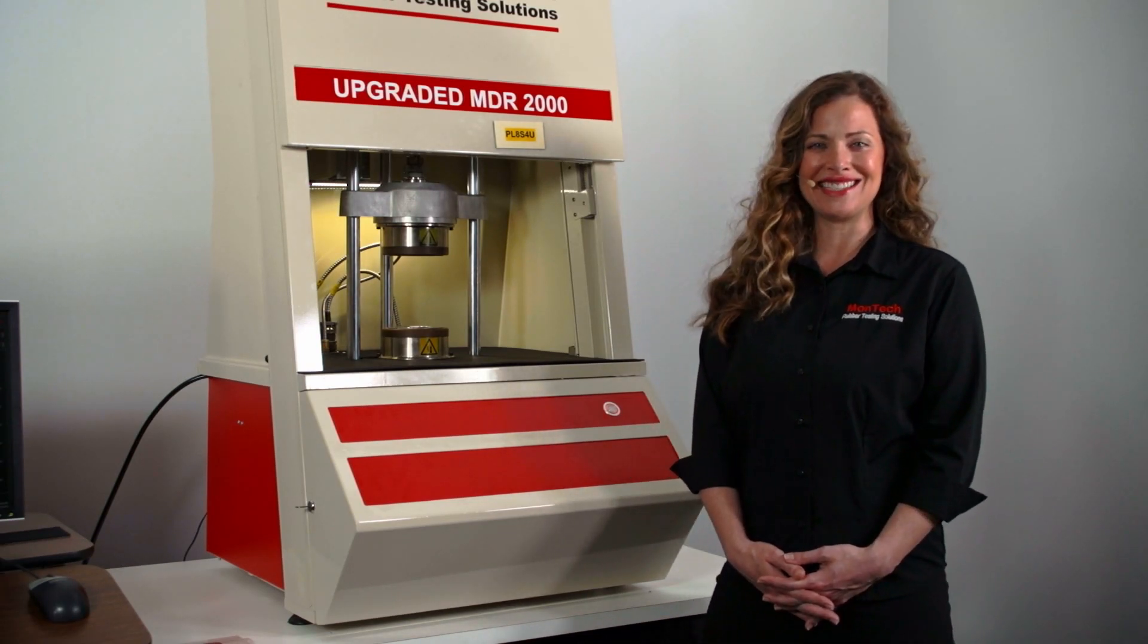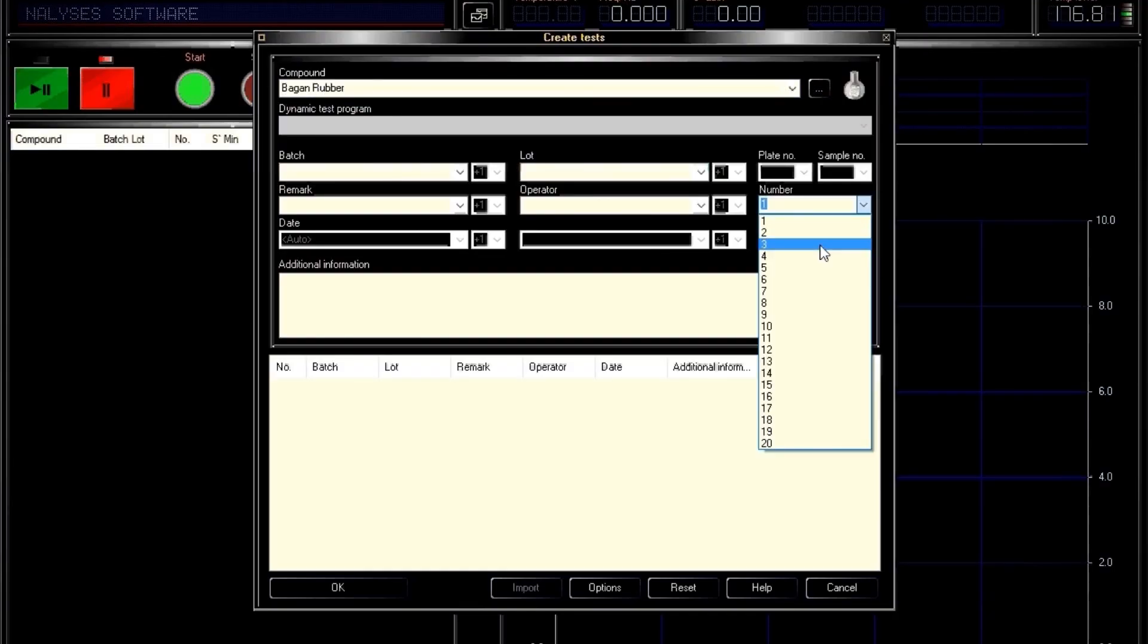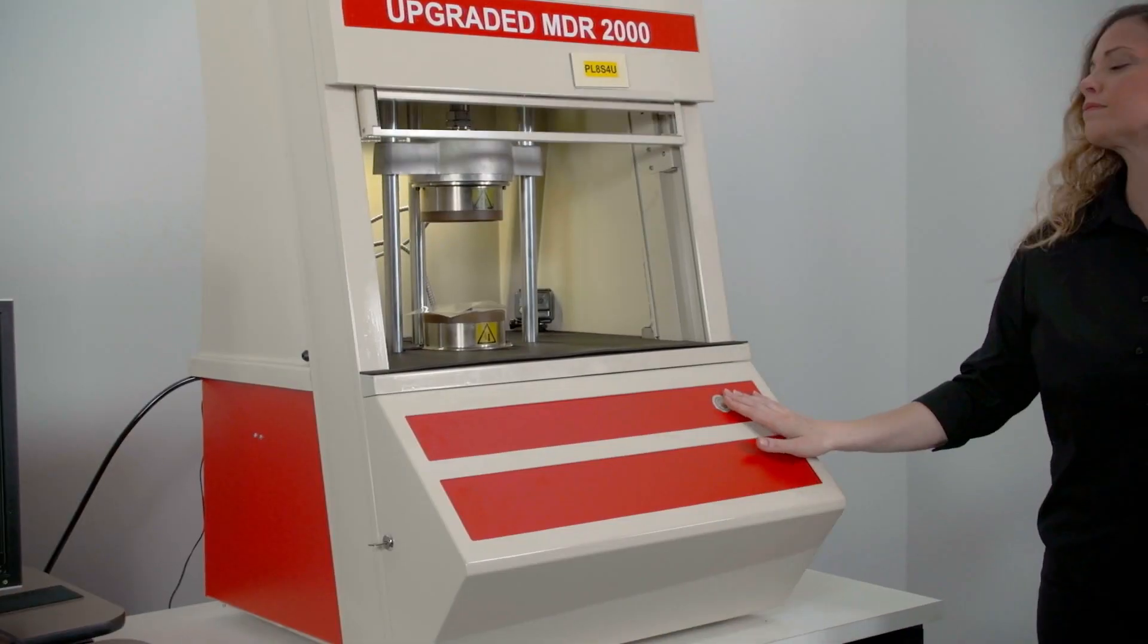Running a test is easy. All you have to do is cue the test, load your compound, and press the start button on the front of the machine.